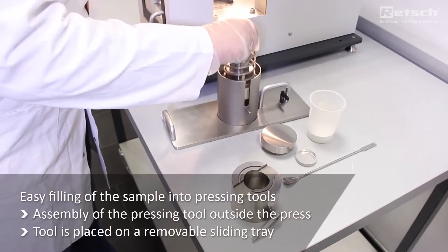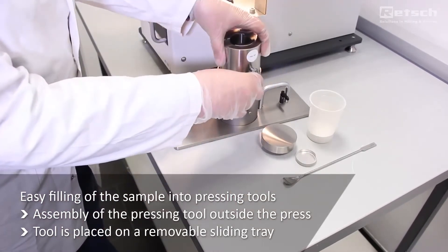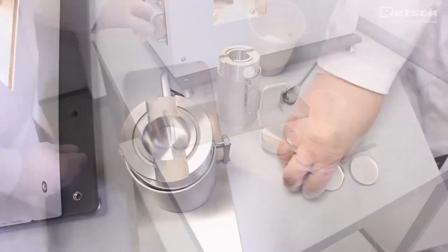The sample can be filled into the pressing tools outside the press. This means with two slides and tools, one sample is pressed while the next one can already be prepared. This increases the sample throughput.